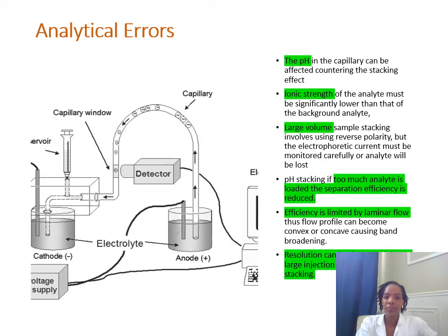Analytical errors. The pH in a capillary can be affected, countering the stacking effect. Ionic strength, large volume, and too much analyte can also create analytical errors.